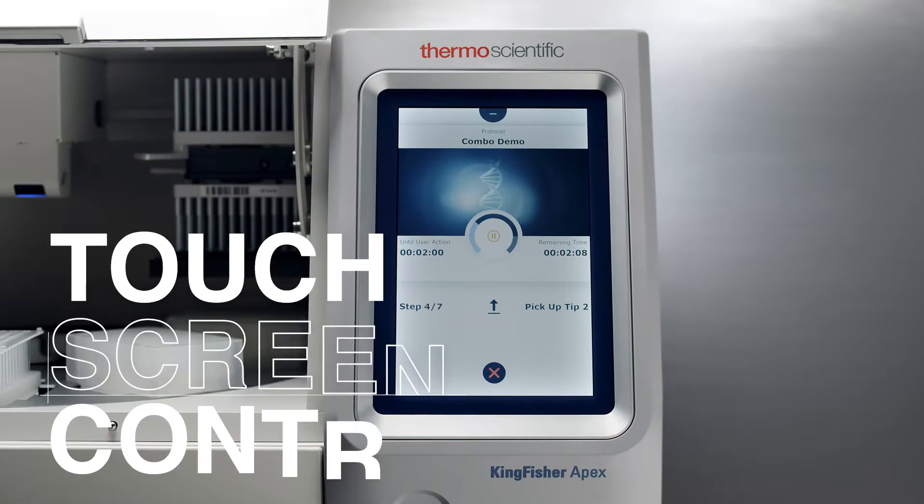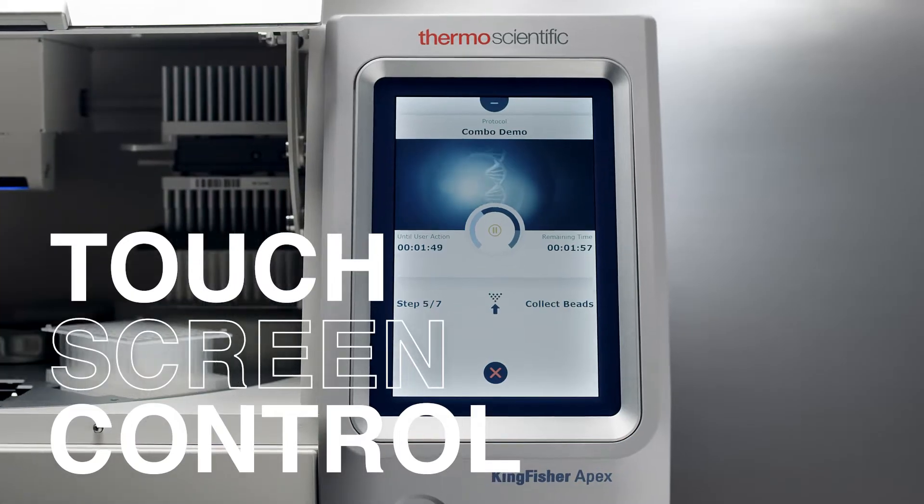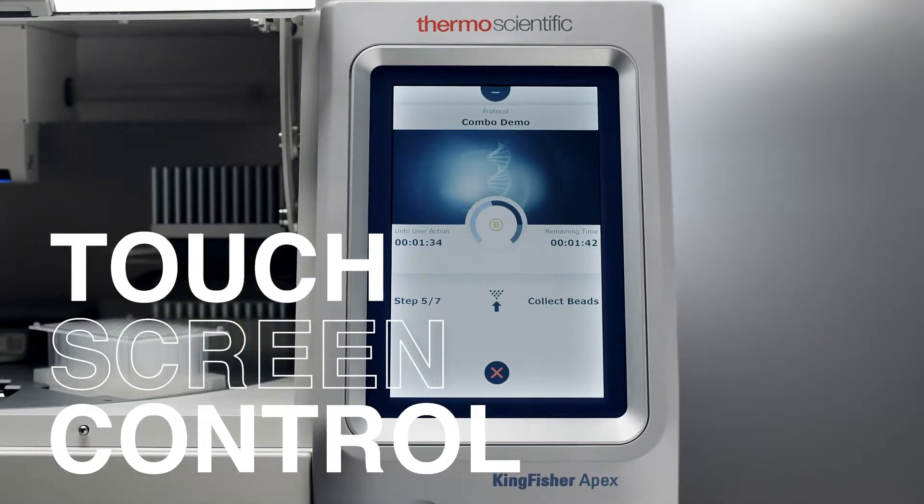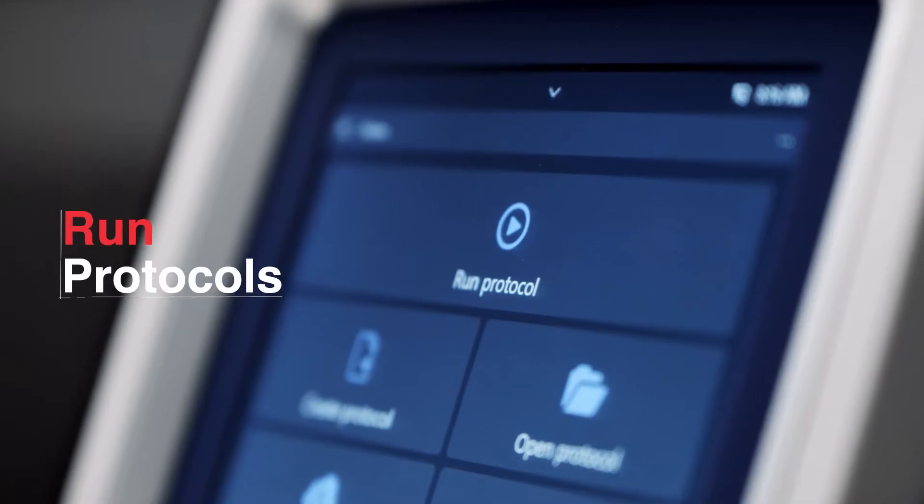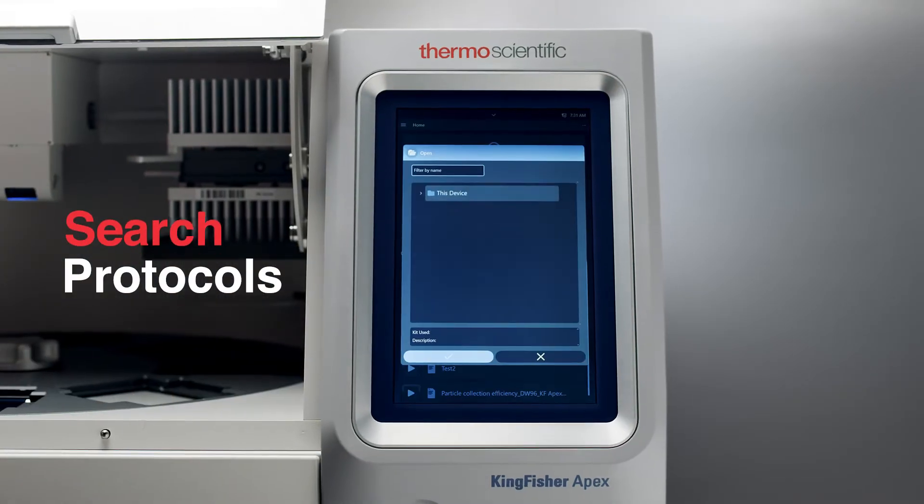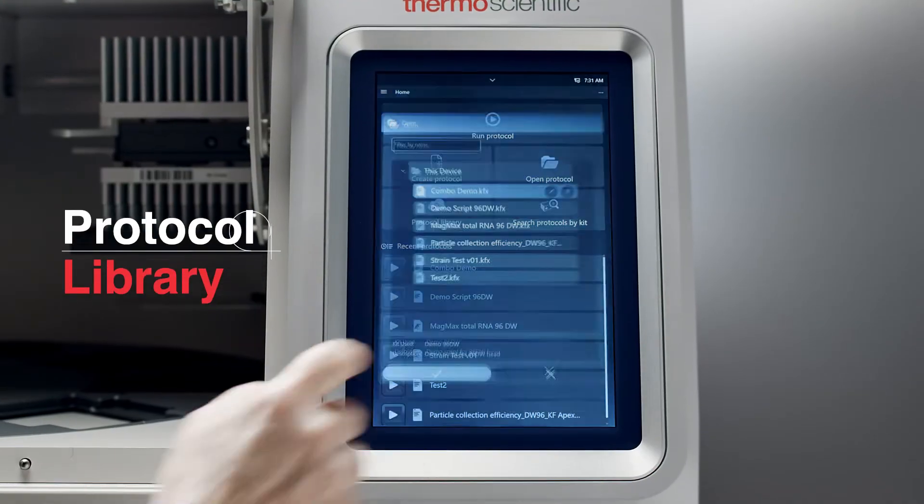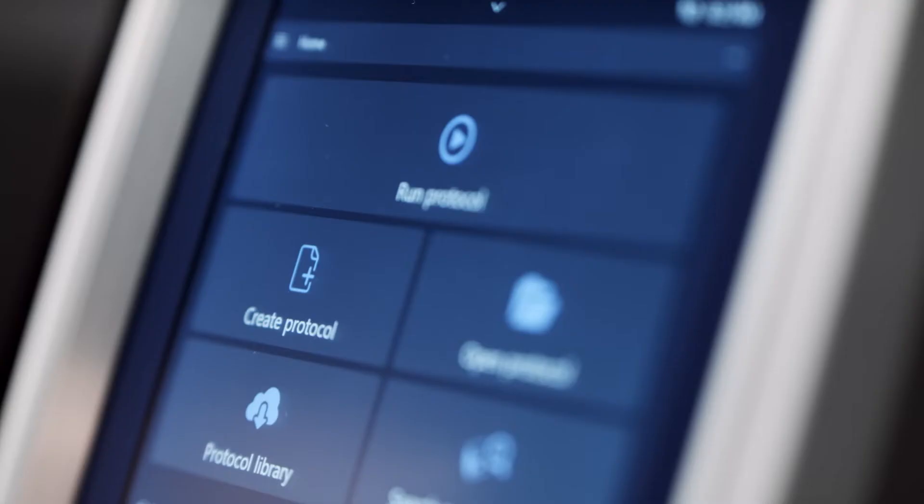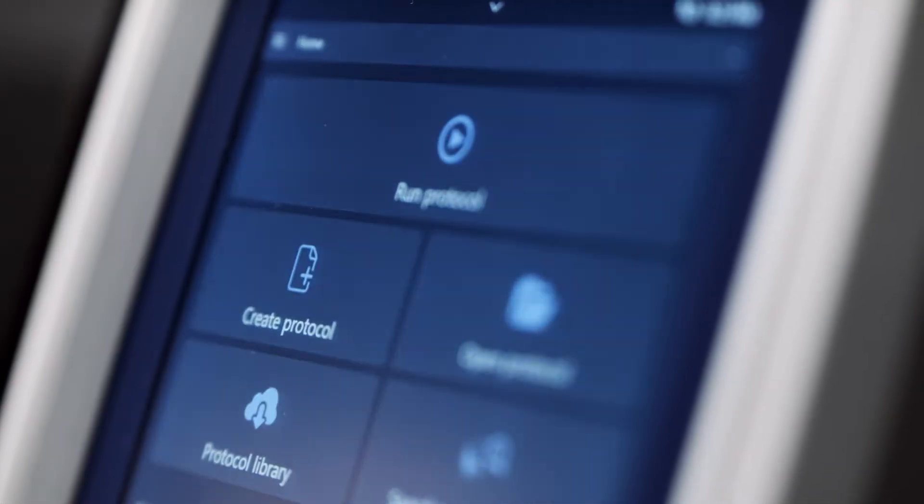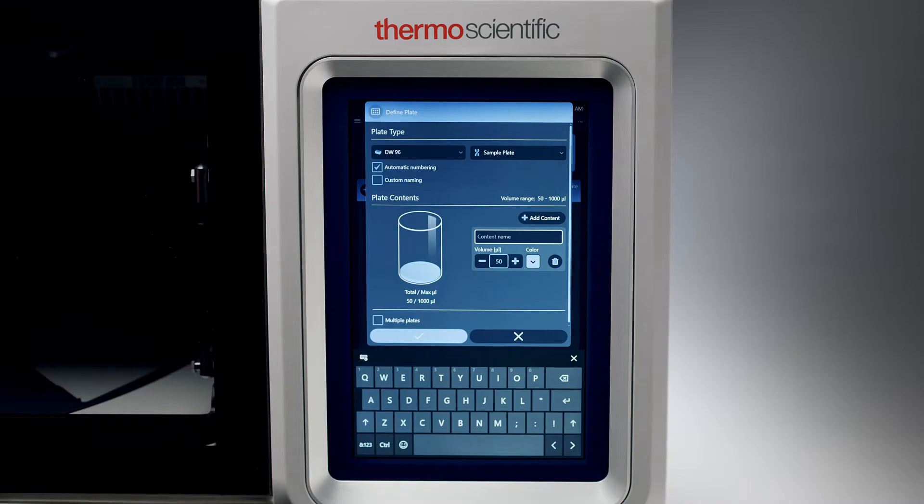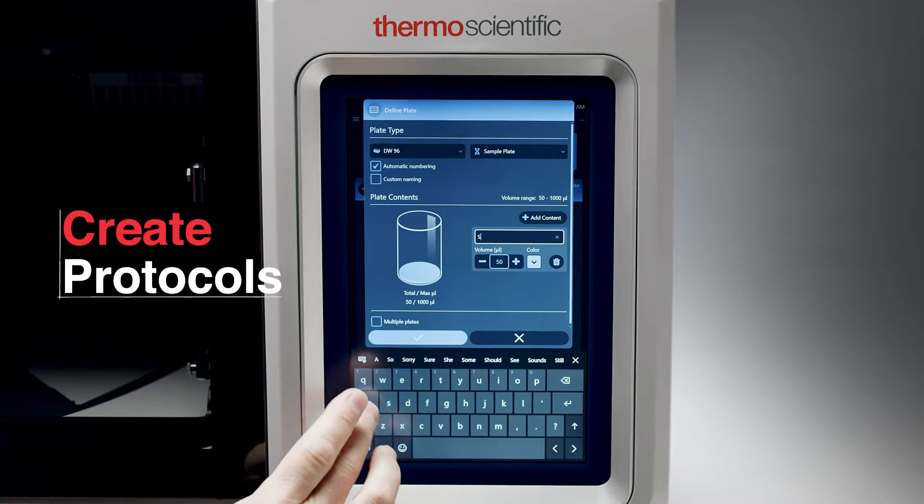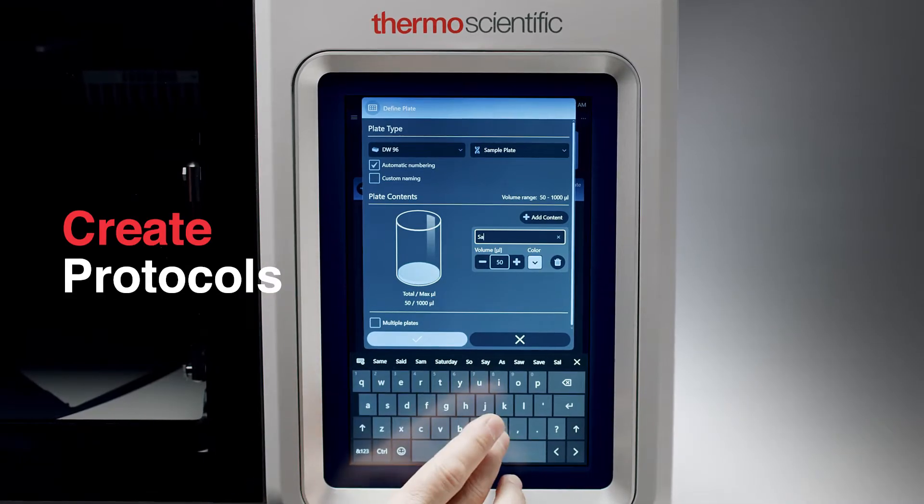One intuitive screen lets you do it all. Run protocols, open and search for protocols, or access the protocol library. And yes, that's right. Customize your protocols or write them from scratch.